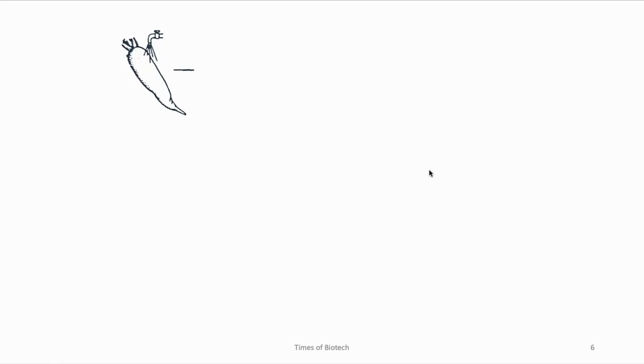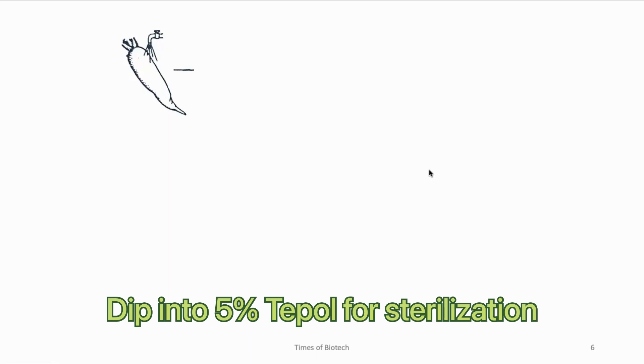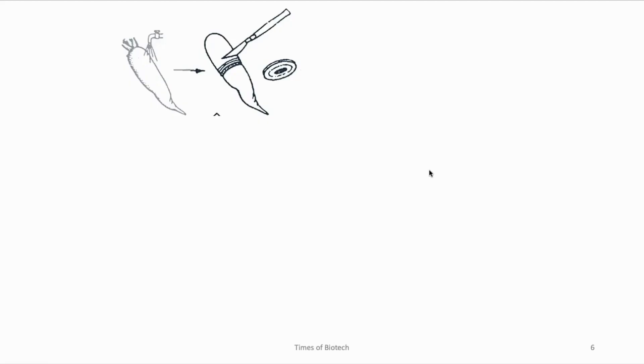For the procedure of callus culture, the first thing we need to do is select the explant. This explant can be any part of any plant as per your requirement. Here we have used a fresh taproot of carrot, which is rinsed with water thoroughly to remove all surface debris, followed by dipping the taproot into 5% Teepol for 10 minutes. You have to perform all the steps in a laminar airflow under aseptic conditions. Even the scalpels used for the procedure must be dipped into 70% ethanol and flamed before every use.